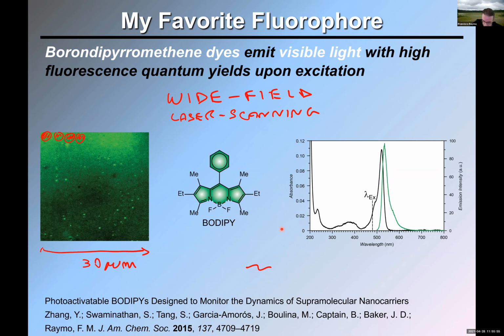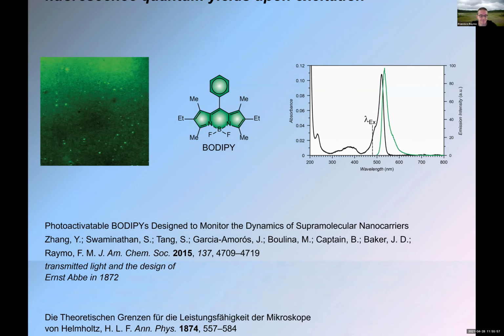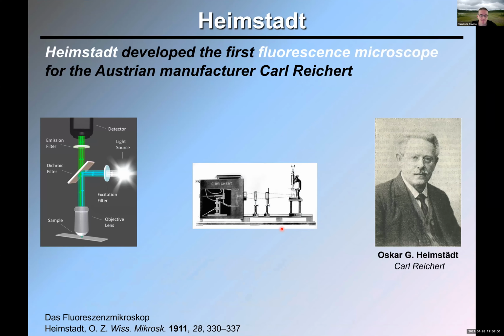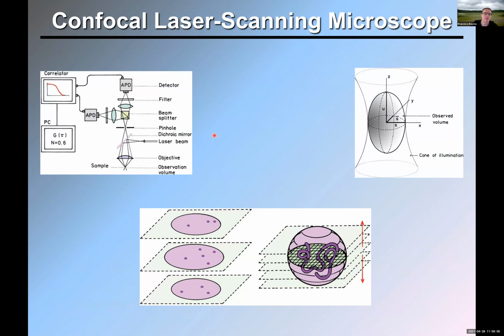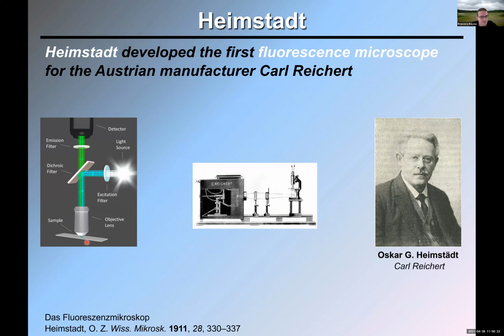Okay, now let me move forward. Okay, so laser scanning is used generally in combination with confocal optics. Now, this diagram over here is supposed to be similar to what we had before. So we have sample, objective lens, dichroic mirror, and laser. If we go back a second, it's the same here. Sample, objective lens, dichroic mirror, and excitation source. So this part is exactly the same.